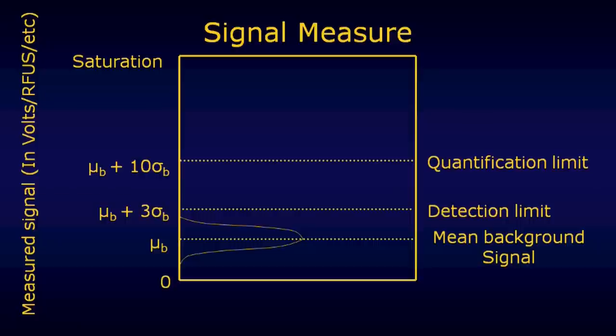We can be so sure that it's that far above the noise levels that we don't even have to worry about the peak's height, in a DNA profiling sense, being compromised or influenced significantly by a contribution from noise. Okay? So we can quantify how much signal is there without worrying about it being polluted or not polluted by a contribution from noise. When it gets above 3 standard deviations above the mean, we can be sure that we've detected something that's very unlikely to be noise, and that in turn probably leaves us with the only other alternative, that it's signal.